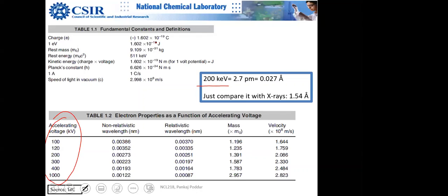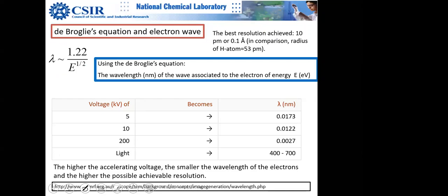So anyway, so I told you the resolution is half of this actually. So resolution for an electron microscope working at 200 kilo electron volt will be half of this. For example, 3 picometer divided by 2. 1.5 पिकोमीटर, ये तो बहुत छोटा हो गया यार, बहुत ज्यादा छोटा हो गया। तो अब हमें इतना चाहिए क्या? नहीं चाहिए, इतना छोटा नहीं चाहिए। और इतना मिलता है, इतना रेजोल्यूशन हमें आता है क्या? नहीं आता है। इसका रीजन वही है, aberration, because no electron microscope is perfect.